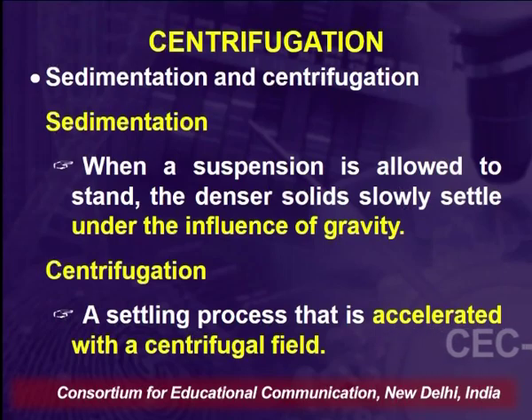So, we know that the particles or materials which have a higher density tend to settle down because of gravity. When these particles are settling down inside the tube, we also put a centrifugal force around it, which speeds up this process of settling down.